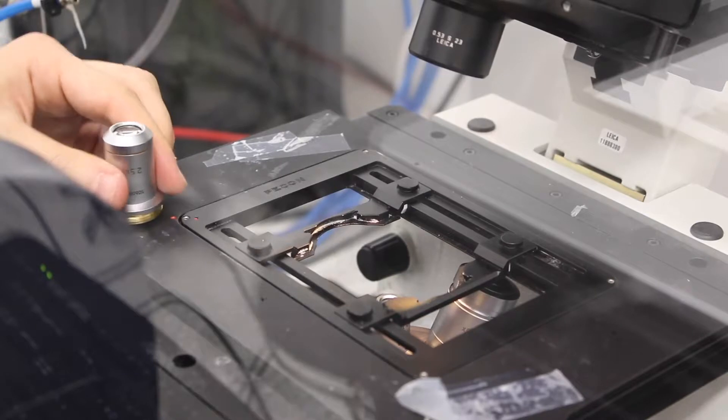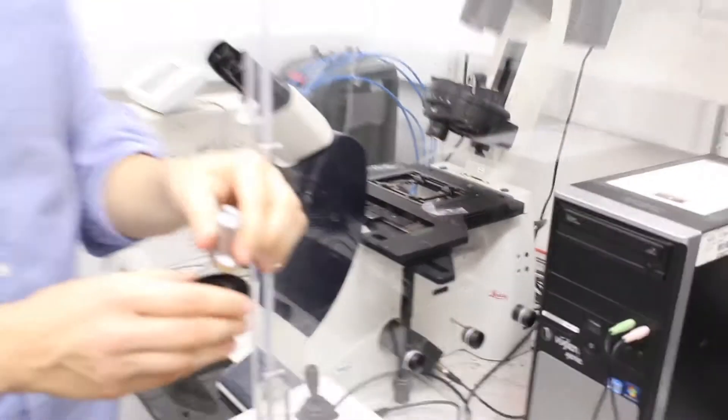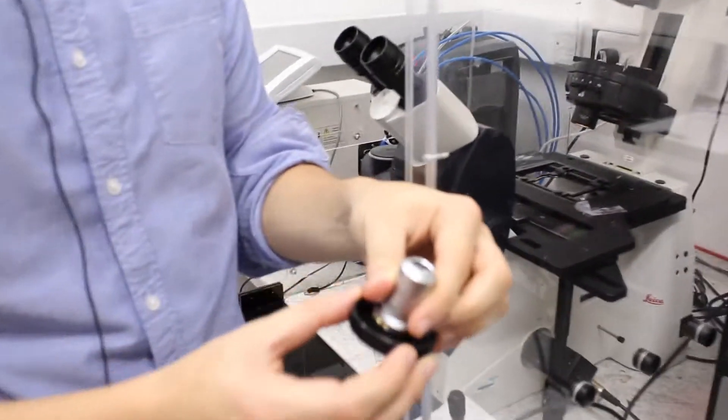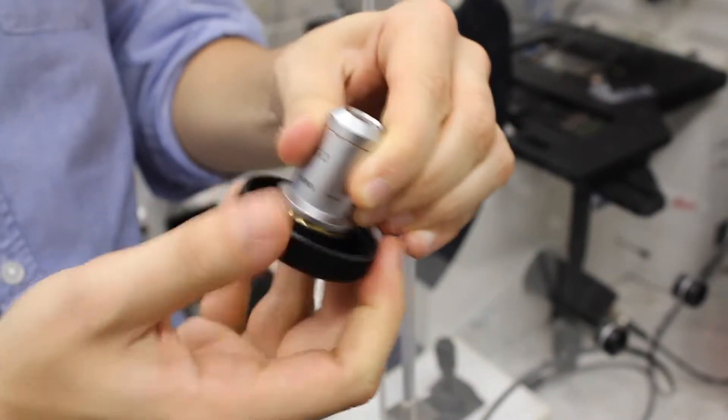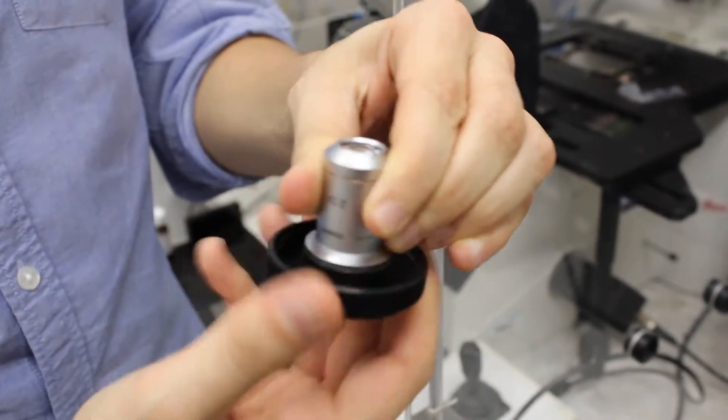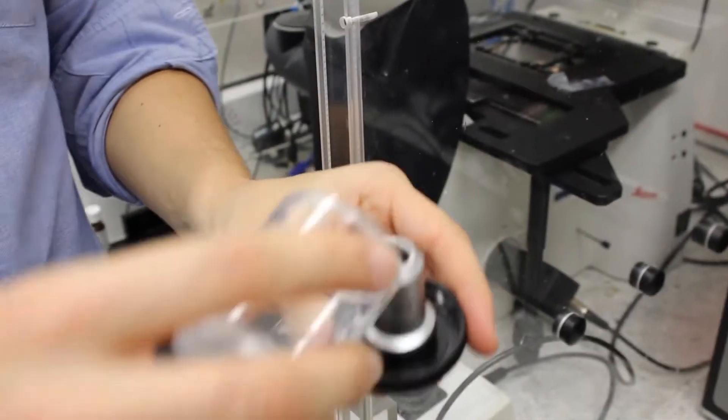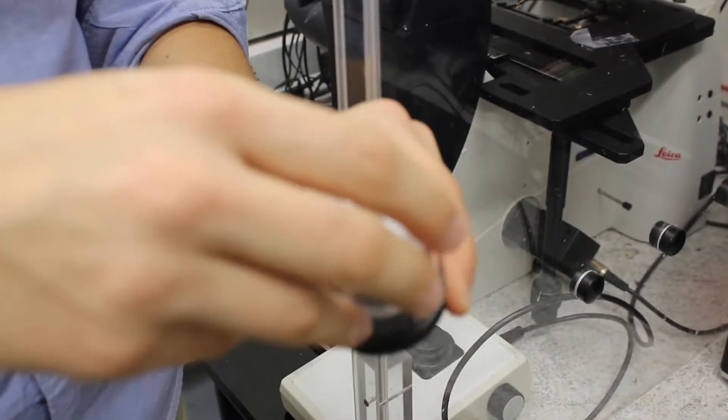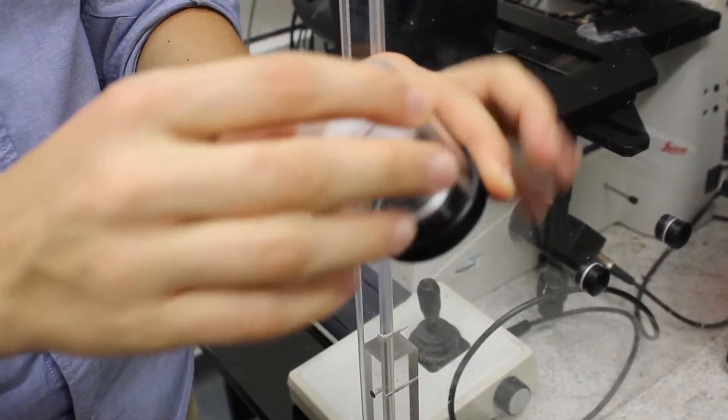And then you place the one that you are not using in the box, again to avoid having any dust on top of the objective. And then you just close the box, so there will be no dust on the objective.